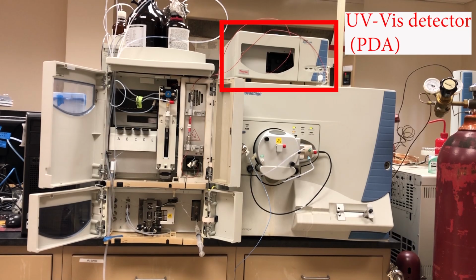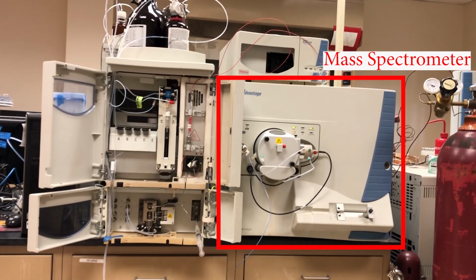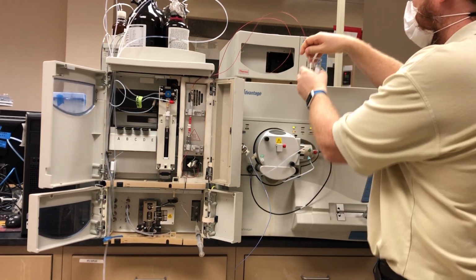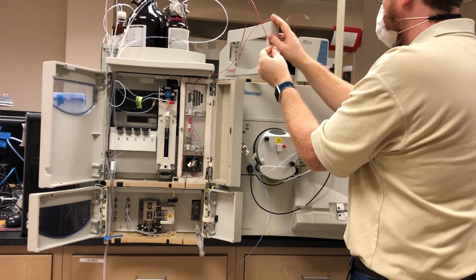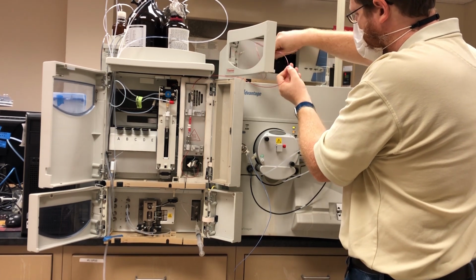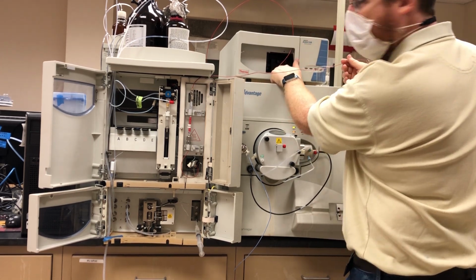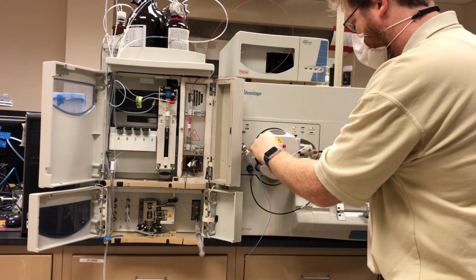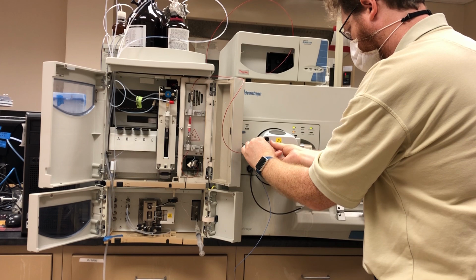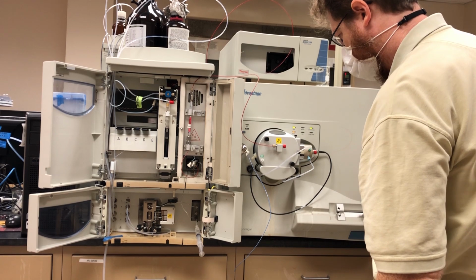So here we have a UV vis detector, a photodiode array up top, and then that big box right there is the mass spectrometer. And we can really just take the output from the HPLC. This is also easier to do because we're at lower pressure. And we can just connect it to the fitting in the front of the UV-Vis photodiode array. And then we'd be doing UV-Vis. But we will disconnect that guy. And we can then just hook it up to the mass spectrometer, flow it into the mass spectrometer. You can actually also hook it into the UV and then have the output from the UV go into the mass spectrometer, so you're using both the UV detector and the mass spectrometer if you want.